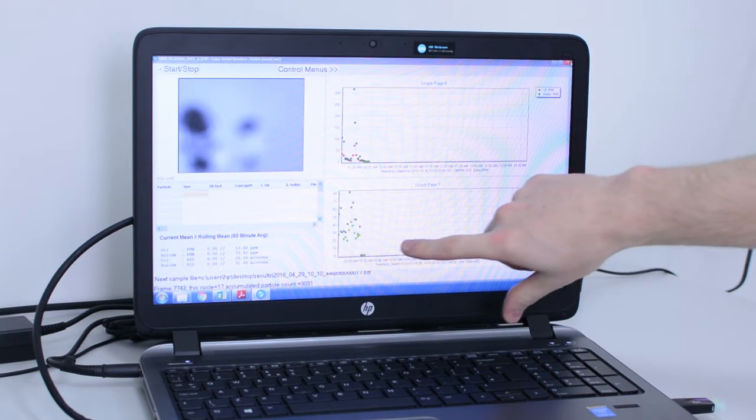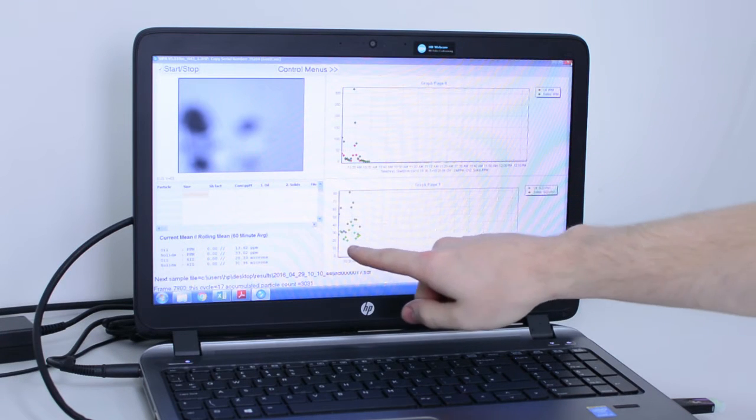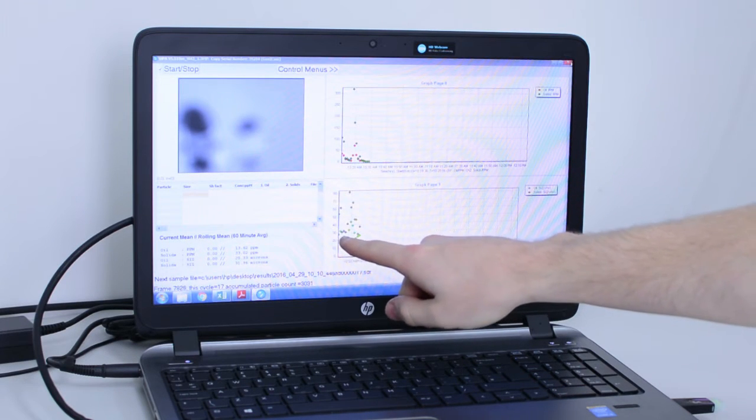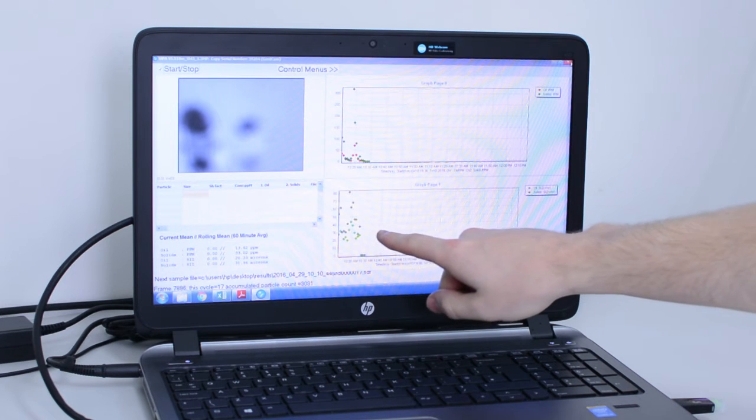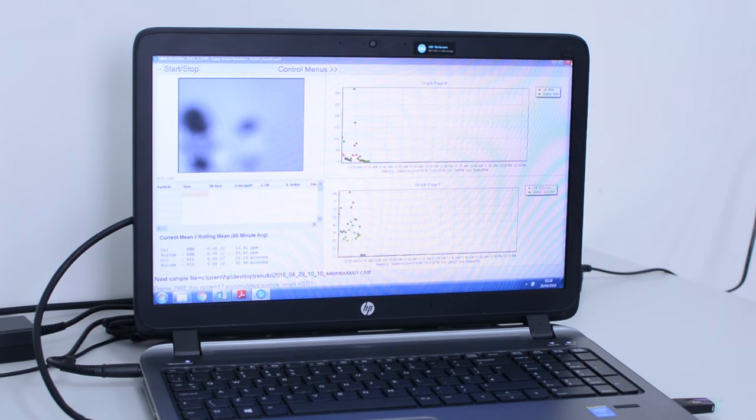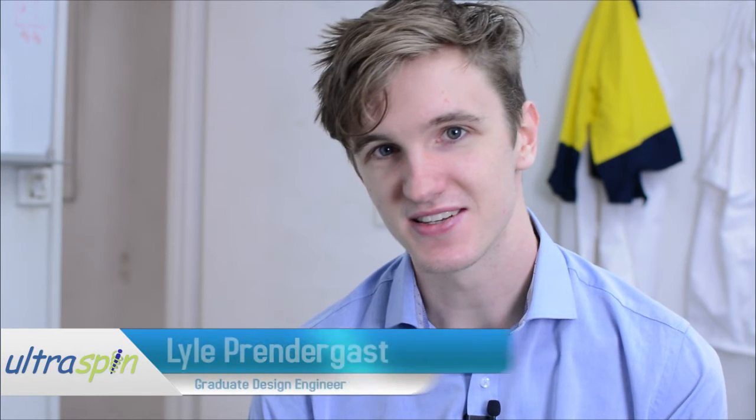You can see here from the graph that the program has produced that the mean bead size is about 30 micron, which is what we would expect. But unlike these ceramic beads, real-life oily water can change over time — droplets can come together or coalesce to form larger droplets, or they can be broken apart during your process into smaller droplets. So it's very important that you measure the oil droplet size in real time.